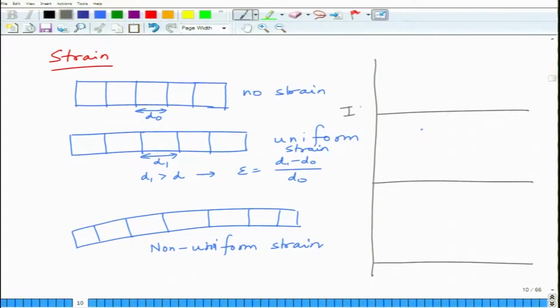So this is intensity axis and this is 2 theta for all of them, okay. And if I choose a particular peak, let us say this is the equilibrium 2 theta B. So this will show you a peak which is something like that. If you have a uniform strain, the uniform strain will allow this peak to be shifted.